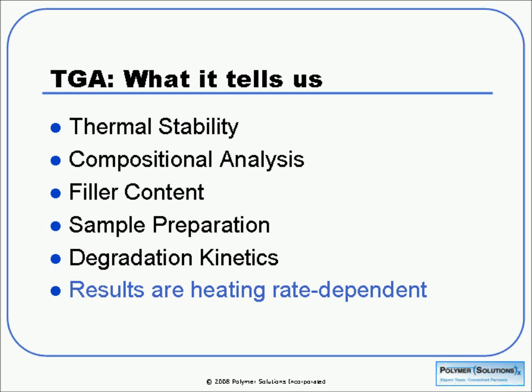So by measuring the mass during the test, we can actually see at what temperature that sample starts to lose mass or volatilize.